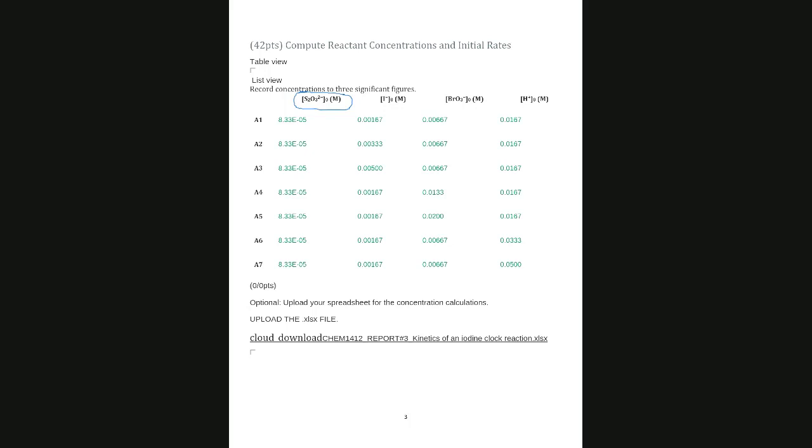Basically, we are using the method where we divide one over the other in order to get all those A, B, and C. But because this lab has so much data, I think the best way of doing it is to go step by step, doing what the report is asking you, because basically they are guiding you towards the end.